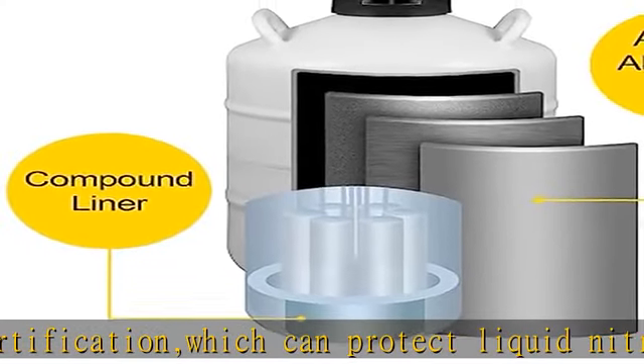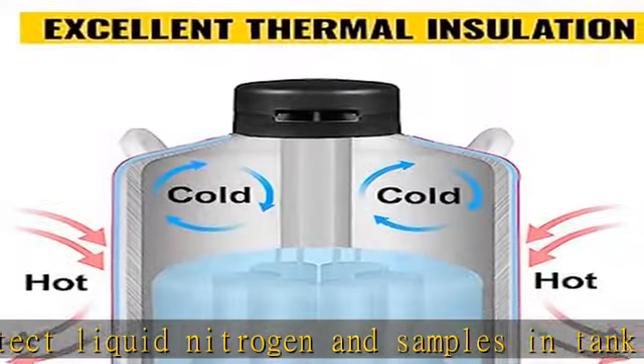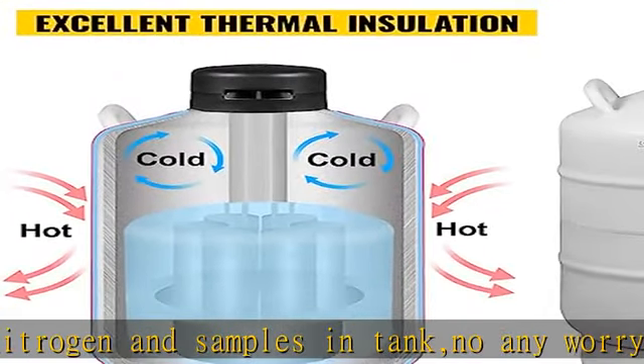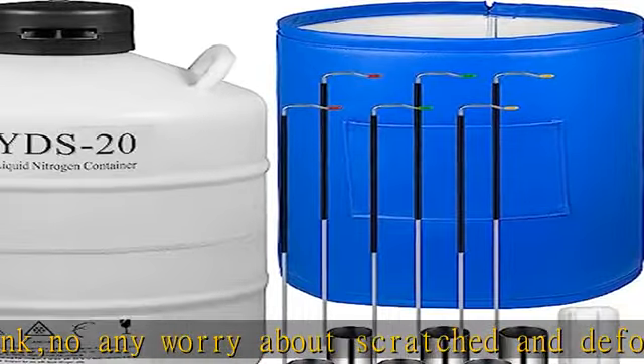6 canisters: the liquid nitrogen tank comes with 6 canisters, of which 2 are without holes for retrieving small amounts of nitrogen, or with holes for holding samples.